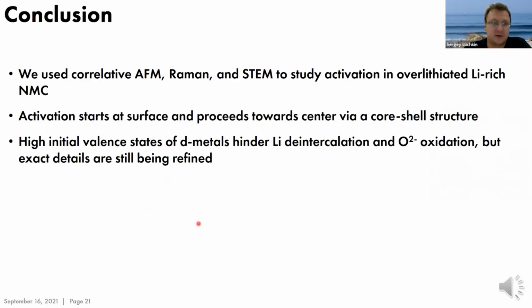So let me conclude. We used correlative AFM, Raman, and STEM to study activation of overlithiated lithium-rich NMC. Activation starts at the surface and proceeds towards the center via a core-shell structure. Based on the data we have, it seems that high initial valence states of d metals hinder lithium deintercalation and oxygen oxidation, but exact details are still being refined.